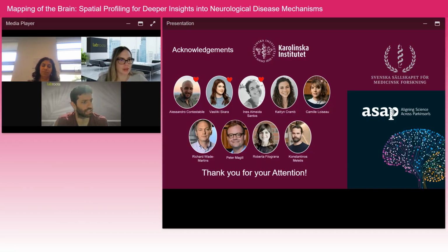The nice thing with the Vizgen software was that it was fully automated, because you use this cytoplasmic marker and the DAPI that is also for the nuclear. And then I didn't count the cells myself, so the data was just fully automated. When I saw the vulnerability, then I believed it. I said, okay, that's how it is. It cannot be something else.